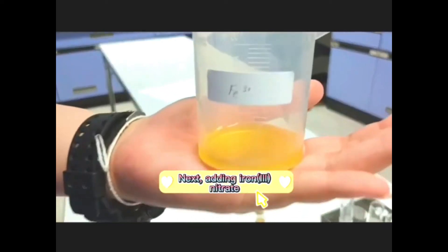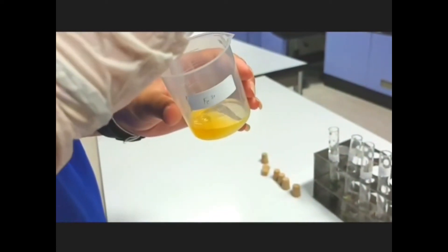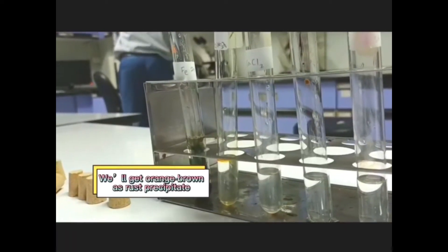Next, adding iron(III) nitrate to the second test tube. We will get an orange-brown precipitate.